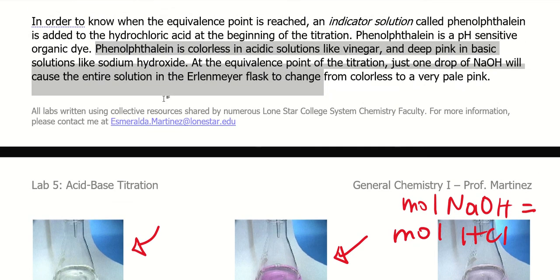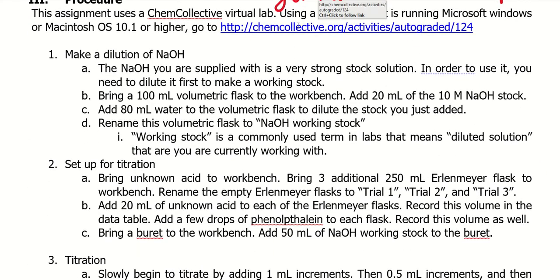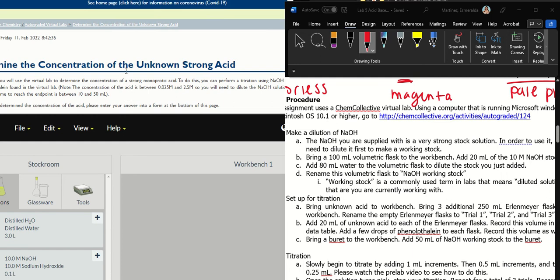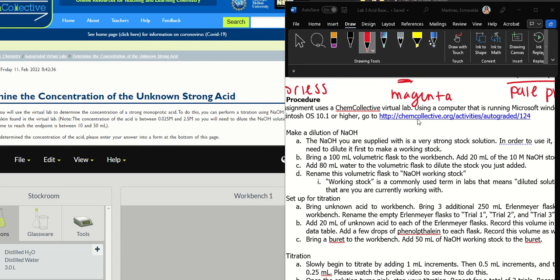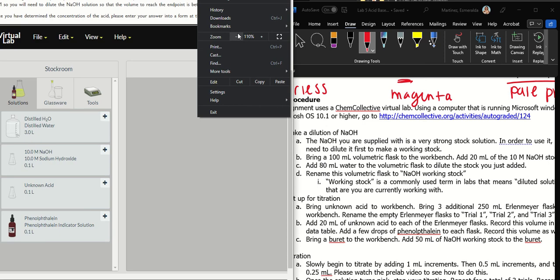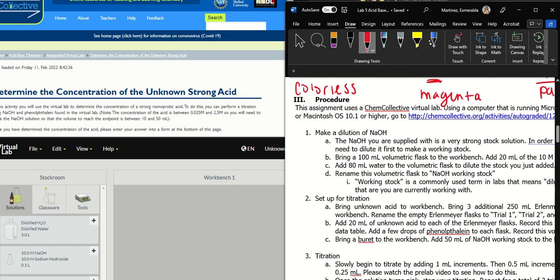So, essentially, this is what you're doing. This is what you're going to witness in the virtual lab. So I'm going to go ahead and do a half split screen. Okay, so now you should be seeing a split screen between the lab procedure and then here I have loaded the ChemCollective lab. So you're going to click here. This is how the ChemCollective lab should look, of course, as always. There are three major portions to this lab.